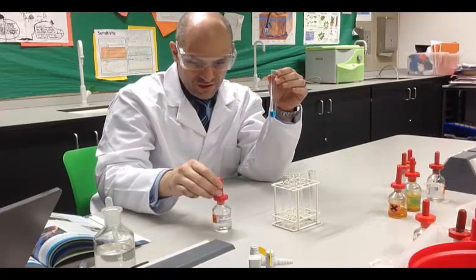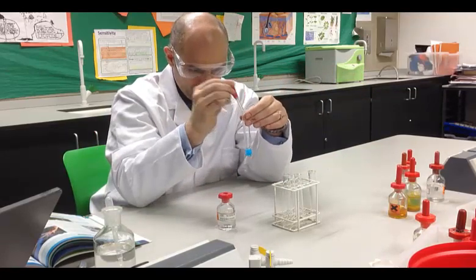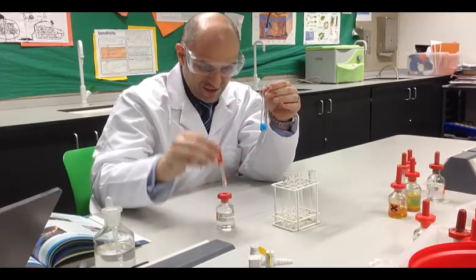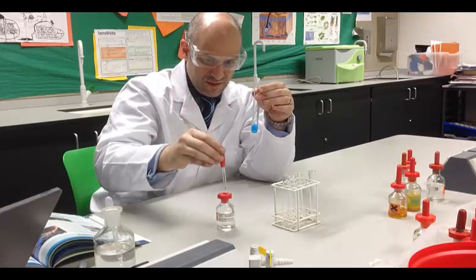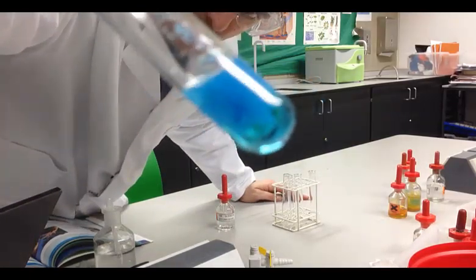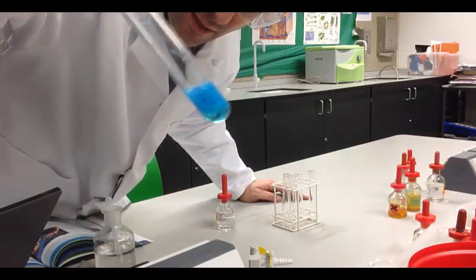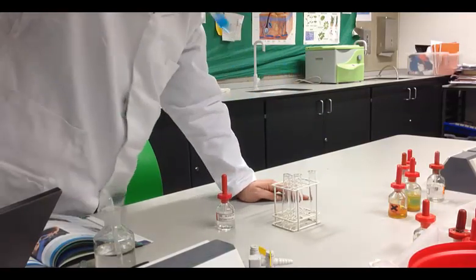Okay, so copper 2 sulfate. I'm going to add some test reagent. And notice you get this snot-like precipitate form. This beautiful royal blue, gelatinous, that means jelly-like precipitate. Copper 2.